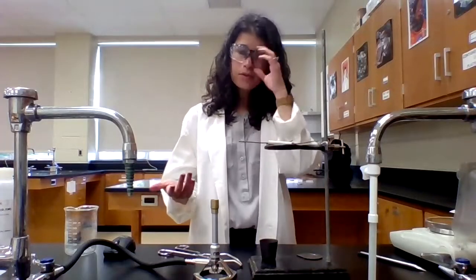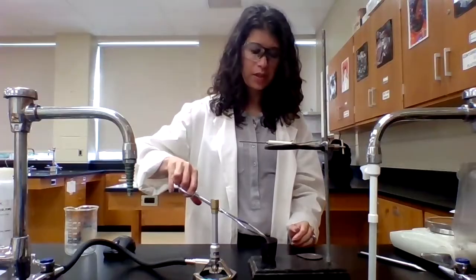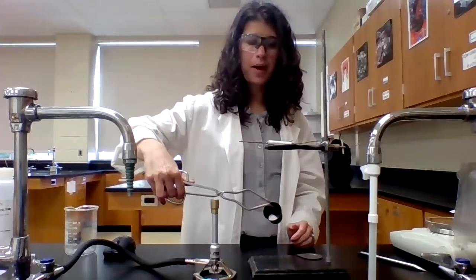Okay, so now that my crucible has cooled down, I've recorded the mass of the empty, dry crucible. I then added the sodium carbonate to it, and you can see that's at the bottom of the crucible here. Now, I need to heat this as well. The group 1 carbonates are hygroscopic. They do absorb water from the atmosphere.